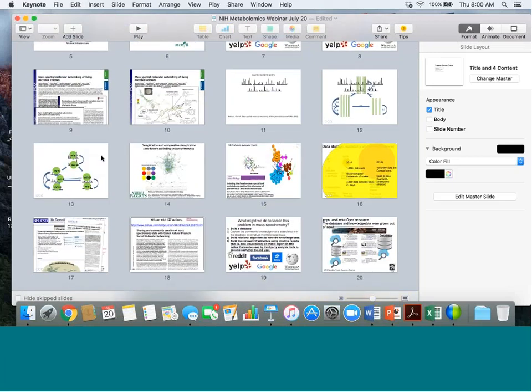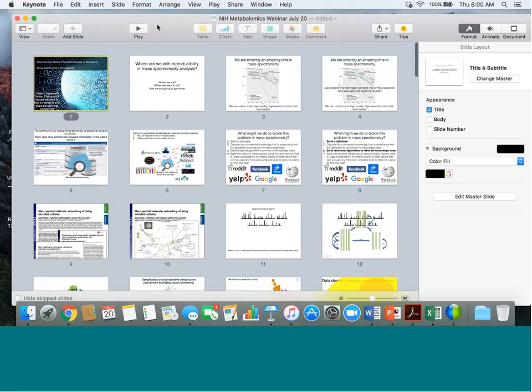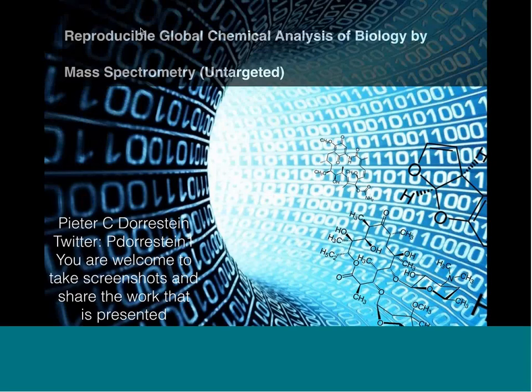But the first question: is there a way to include the publication references into this database, allowing us to identify the sources of these NPs? Yes, so you can update any public data sets afterwards with the publication itself. Any data set that is in GNPS has an accession code that we provide, an MSV number, and you can put those into publications. So both of these should be linked. So you can indeed do that.